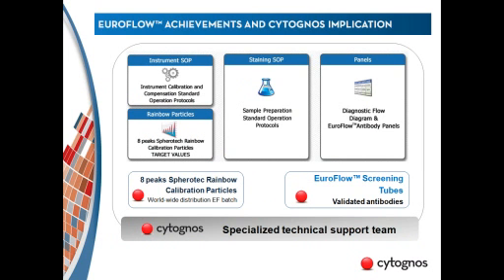The achievements that EuroFlow has nowadays are the same I told you. After 6 years of evaluating new panels and new antibodies, doing a lot of cross studies between laboratories in order to define the SOPs, they finally released, apart from the paper, different protocols, which are also available on the website, let's say, to get this standardization for everyone.